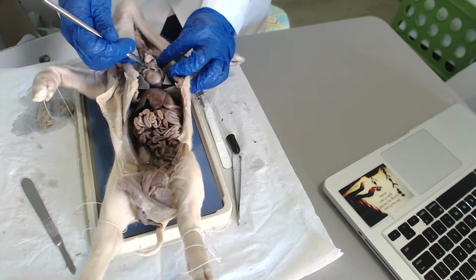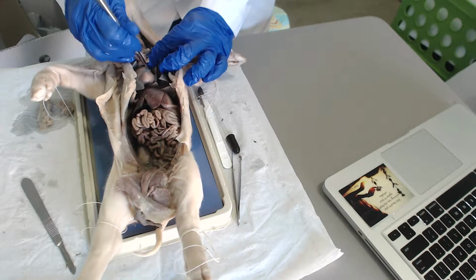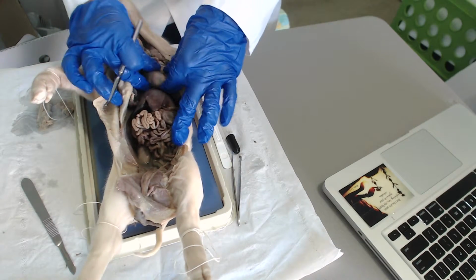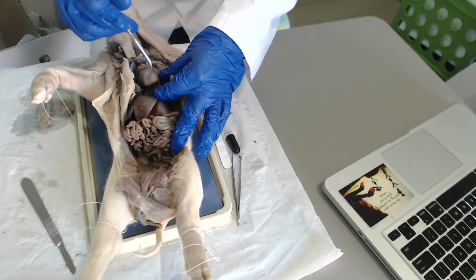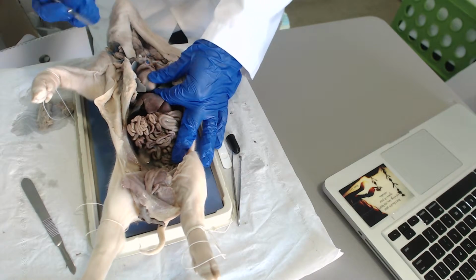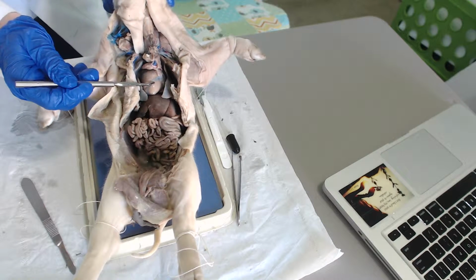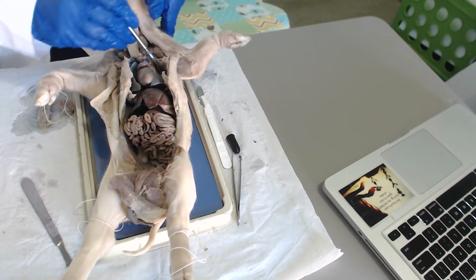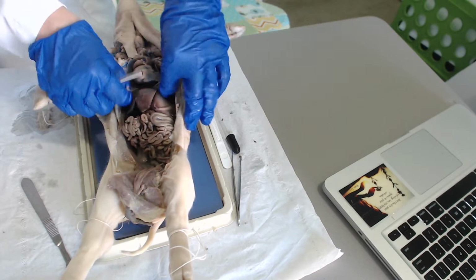And you're going to find your heart. You lift up the thymus gland. You're going to find your heart right here. So it's sitting right here inside the left cavity where the lungs are. So right here, and you have the pericardium. So this is the heart.